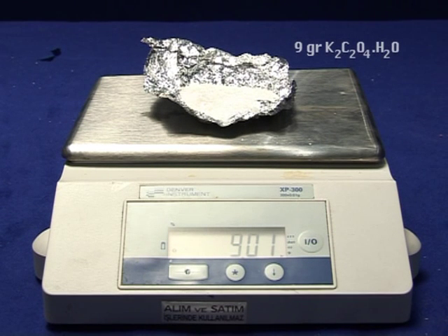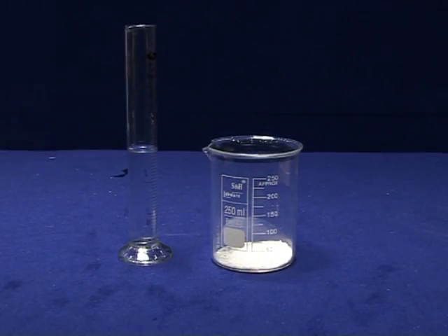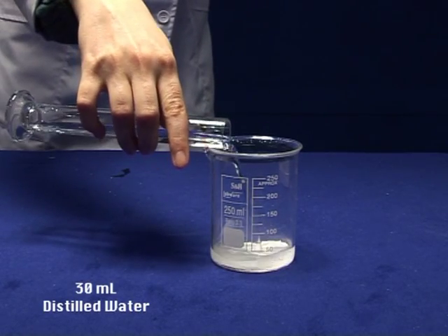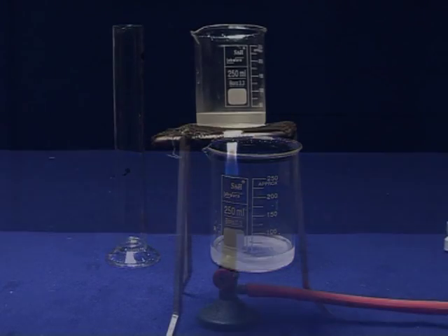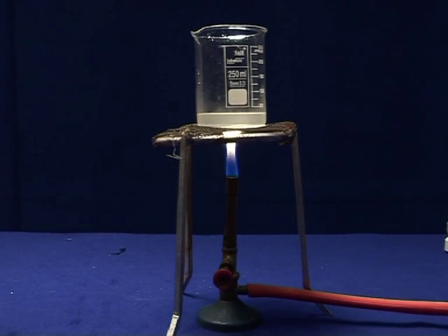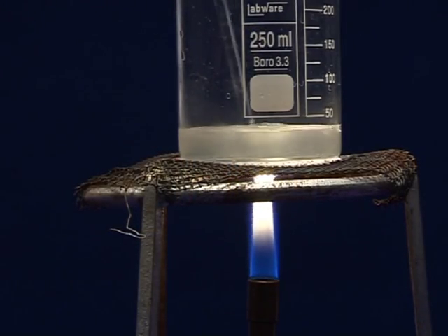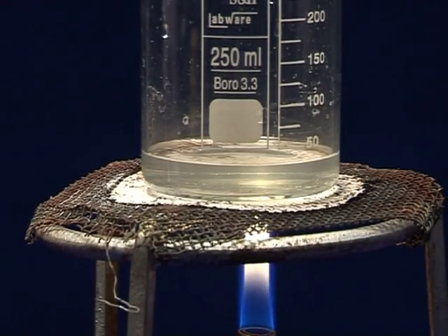Preparation of potassium trioxalatoferrate trihydrate. Weigh approximately 9 grams of hydrated potassium oxalate into a 250 ml beaker. Add 30 ml of distilled water and heat to dissolve with swirling. Be sure that water is not boiled.